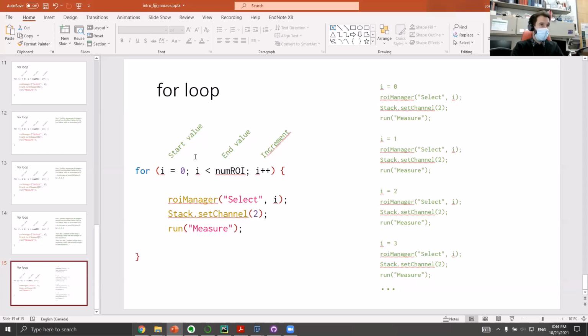So this is what the computer is doing under the hood. It's generating a sequence of integers, and we usually start at 0, going to a max value based on what we want. And then from there, doing the thing over and over. This might be a little bit unintuitive at first, and I totally get that. But it is a very commonly used expression. There are fancier expressions now in other programming languages, but it is really useful to iterate through stuff.